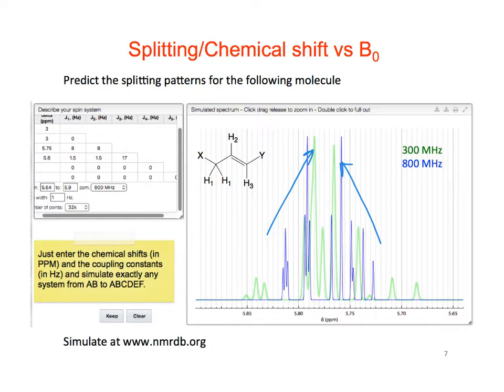So again, you take the tip of this one and the tip of this one, and the chemical shift would be somewhere in the middle of those two. So the chemical shift should be the same. Because normally what I do is I pick peaks, and I pick the top of a peak and call that what I report, and that's what I compare to literature values. That's not what I should be doing. I should be finding that average.